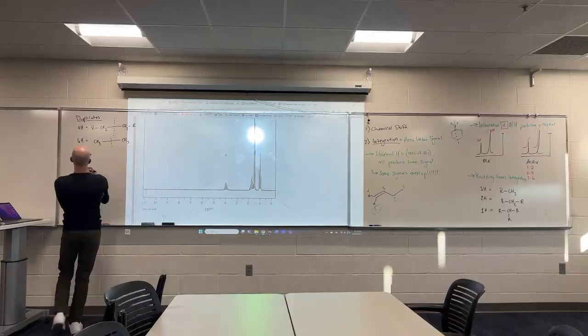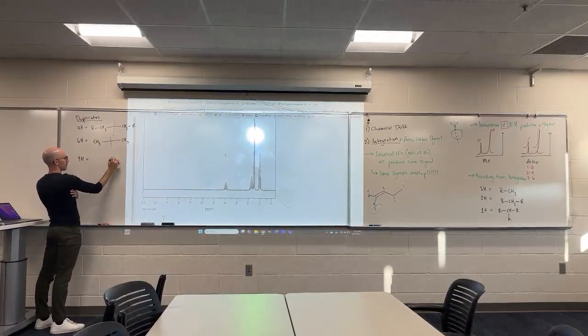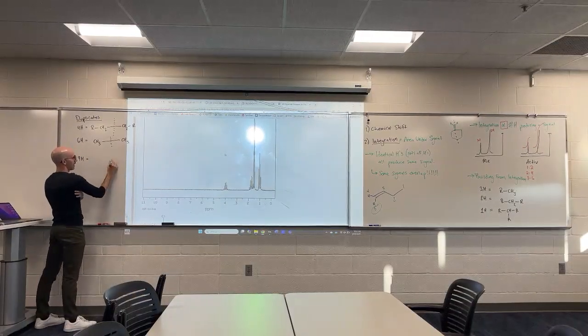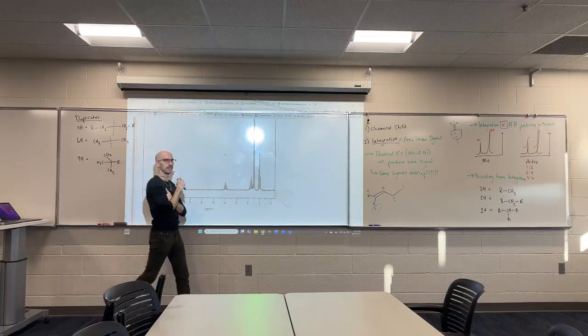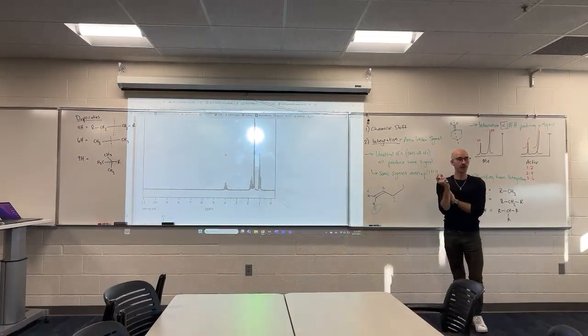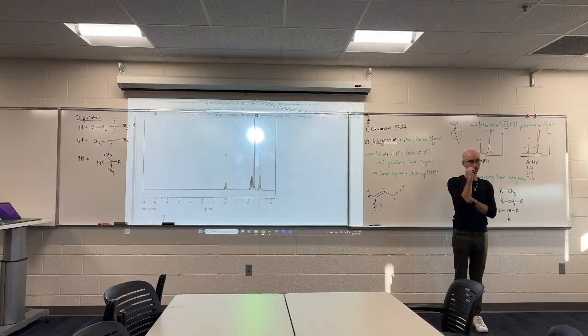On a similar thread, 9H. Nine H is pretty often, what is that group? Tert-butyl. A tert-butyl group has 3 methyl groups, all attached to the same carbon, which means all 9 of those hydrogens are identical to each other.